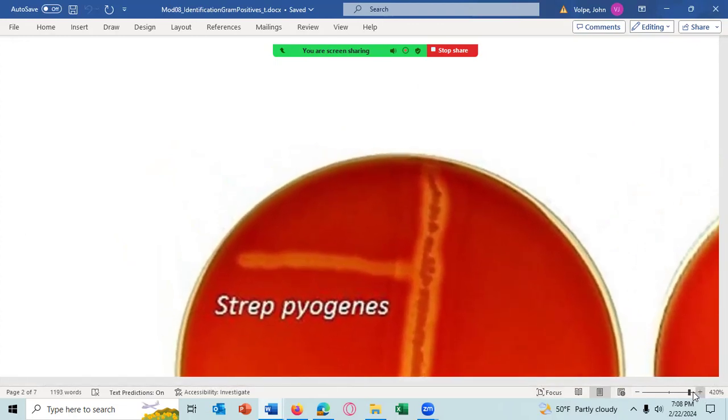And there we have the streak of Streptococcus pyogenes, and it's a real thin streak, sort of a yellowish color. I think it's the photograph that makes it yellowish. Streptococcus pyogenes is not yellow, it's actually off-white. And around it, we have a region of beta hemolysis, complete hemolysis, which is the clearer region. Like I said, that clear region isn't very clear there. It's kind of orange. It's more clear on the next picture. That's just the way this photograph turned out.